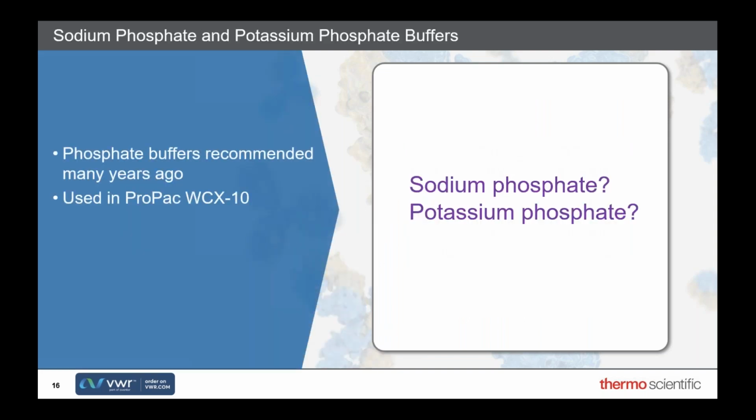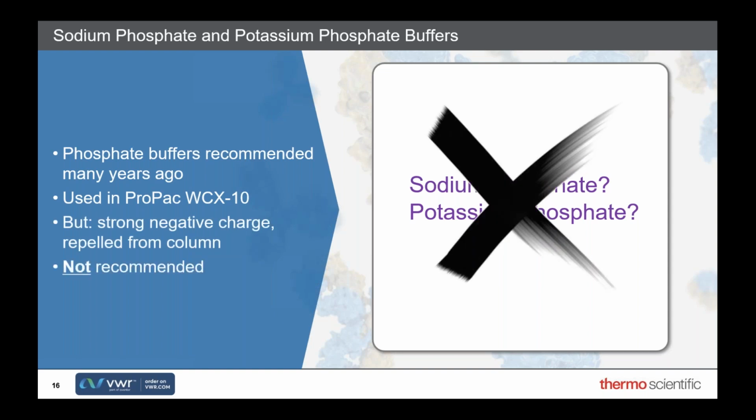I wanted to just make a quick note about phosphate buffers. They were recommended many years ago and were actually used in the original documentation from one of our historically very significant columns, the ProPac WCX-10. But what about now? Actually, the use of online pH monitoring and increased knowledge has made us realize that these are not really good buffers to use. They carry a strong negative charge, and so does the exchange column, and so the phosphate is repelled from the column, meaning the pH might not be controlled adequately. So we wouldn't recommend using these buffers from now on.